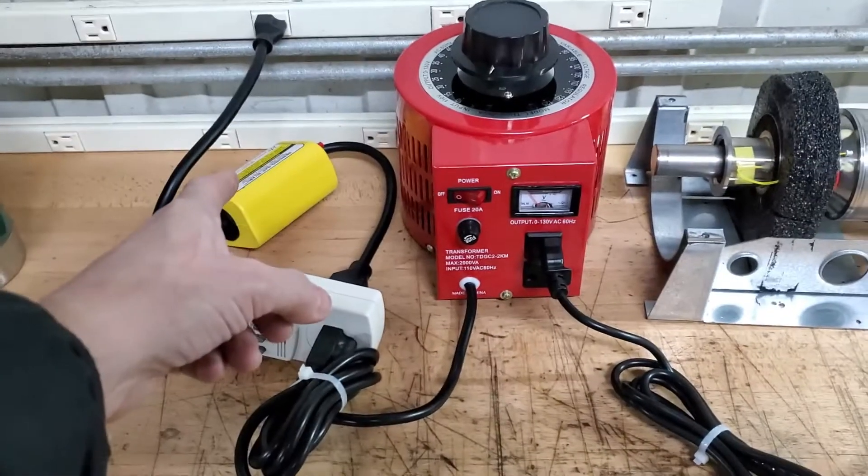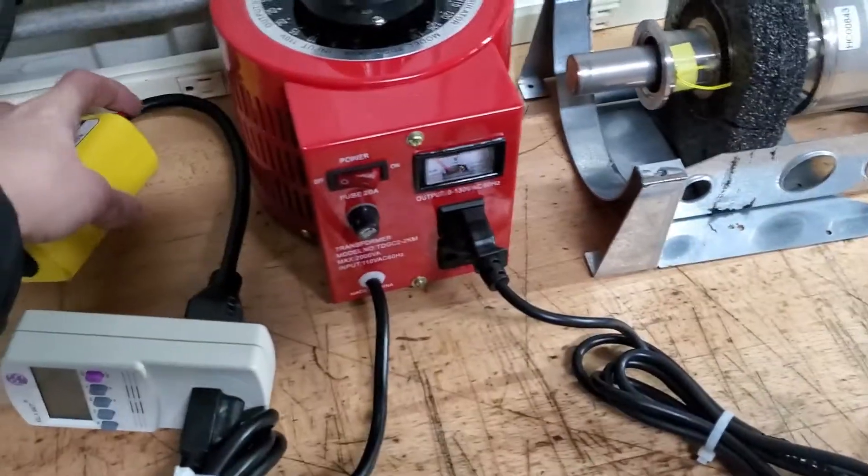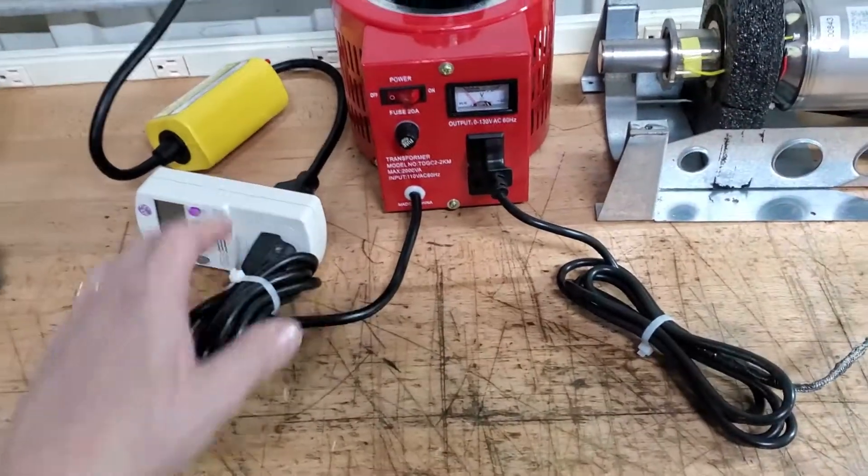First, plug the yellow box into the wall without having anything attached to it and push this red button to reset it. Then put the wattage meter onto it.